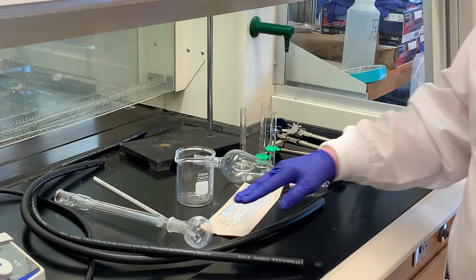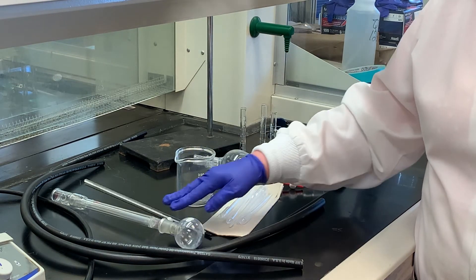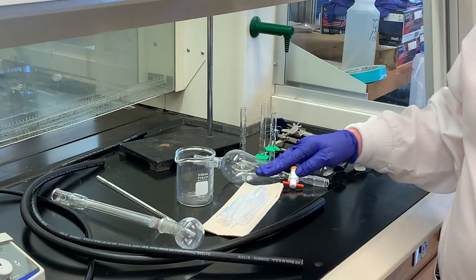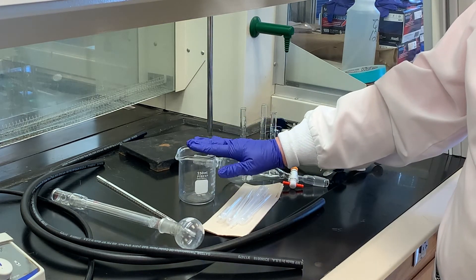The equipment you'll need is a 25 milliliter round bottom flask, condenser, stir bar for the round bottom flask, and thermometer. Our heat source today is going to be a water bath again, so we're going to use a beaker for that.